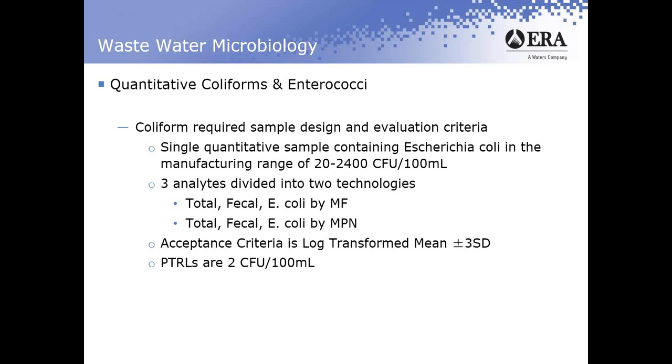The acceptance criteria is again going to be log transform mean, but in this case, since it's a wastewater, it's 3 standard deviations. The PTRLs are set at 2 CFU per 100 mils.